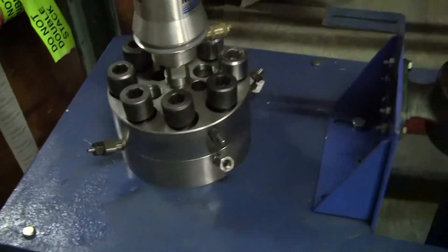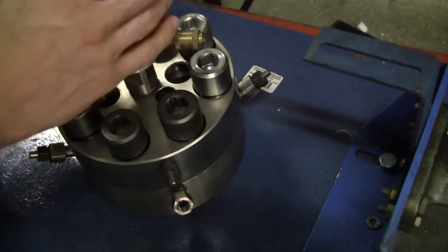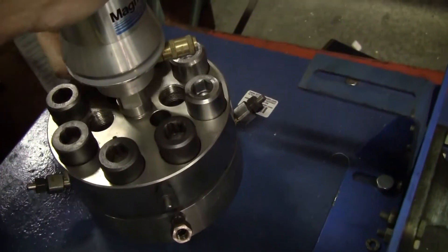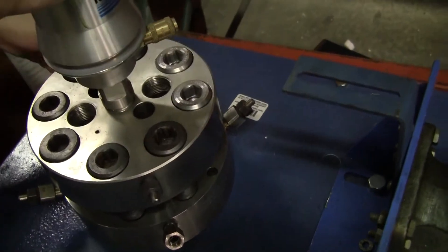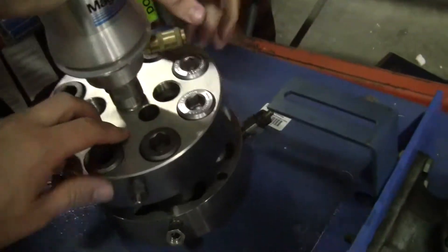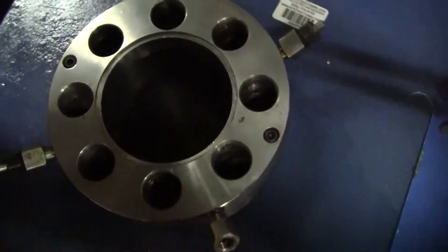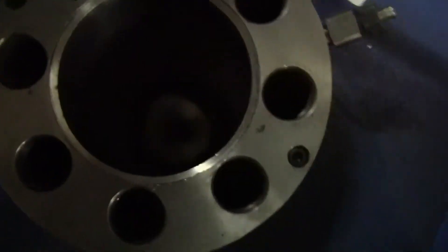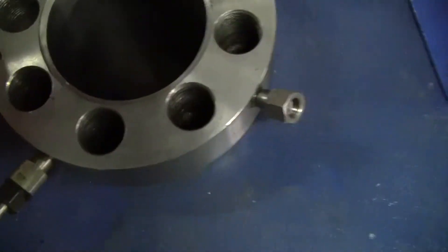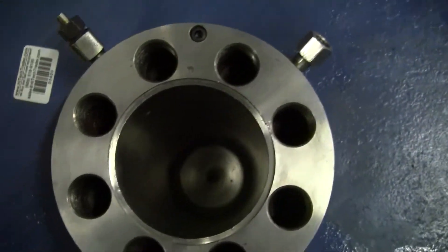I'm going to ask my colleague Brett to now lift it up. We have the impeller and everything else. Take a look at the inside of the reactor. Relatively clean, looks good.